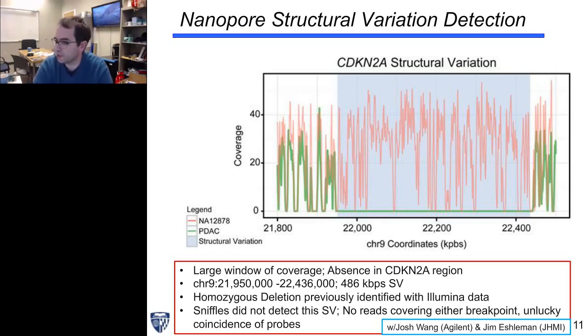We can pick it up by just looking at coverage, luckily, and there are methodologies to do that, but Sniffles is designed to only detect things that you find from breakpoints, at least the version we used was. So manual examination and software which looks for copy number variation or gaps in coverage can pick these up, and with our capture methodology, we can still see these.